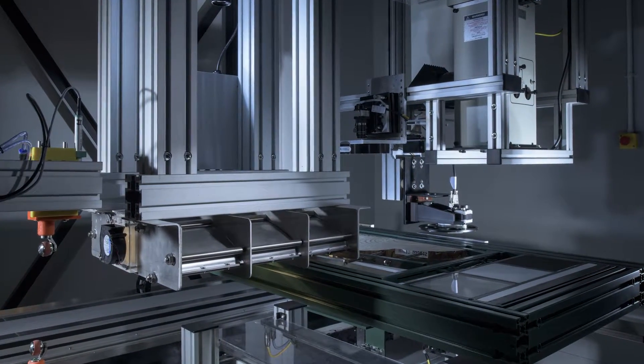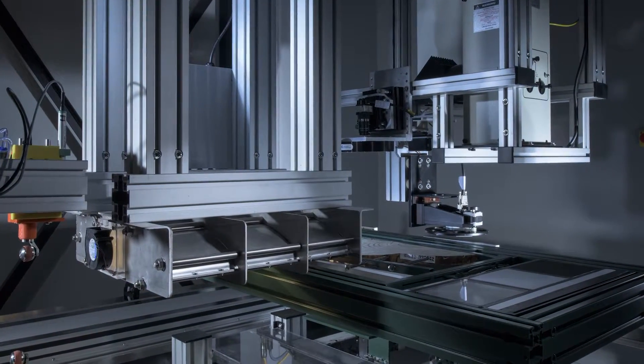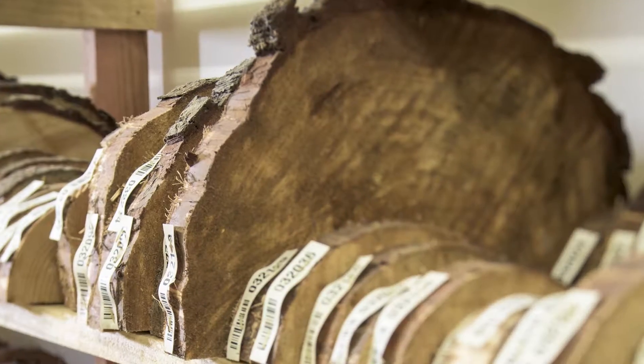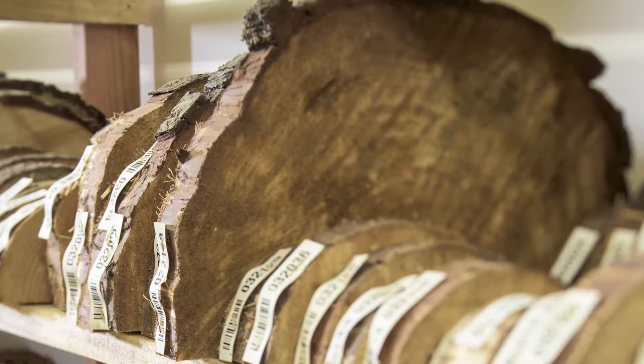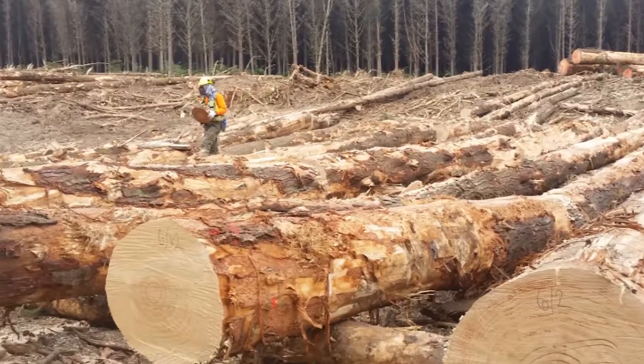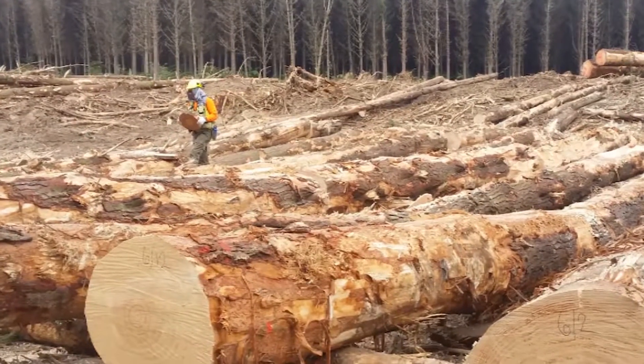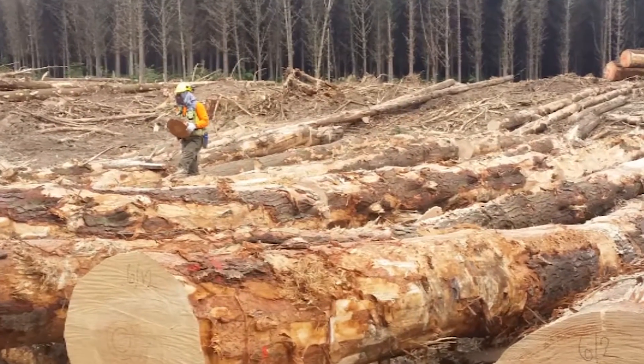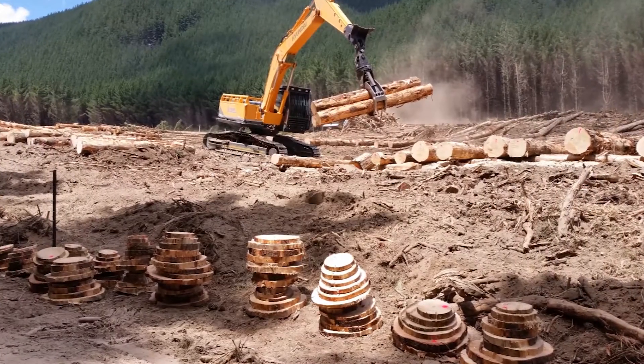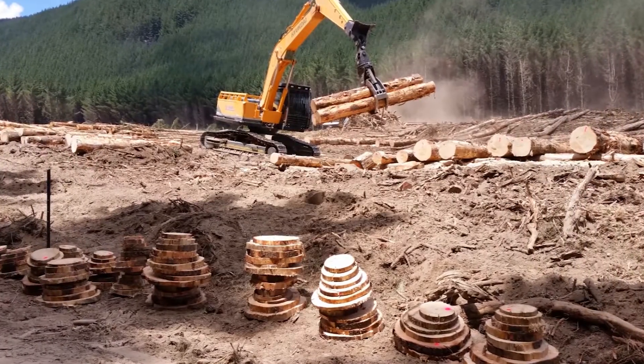The DiscBot is designed to measure wood properties on disc samples that have had minimal surface preparation. Discs are collected from log ends or by slicing up entire stems.